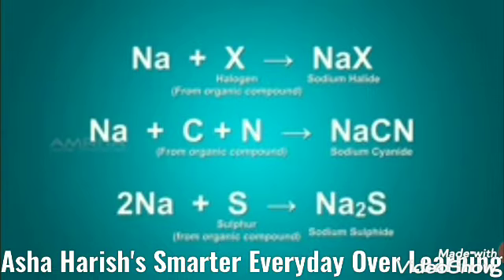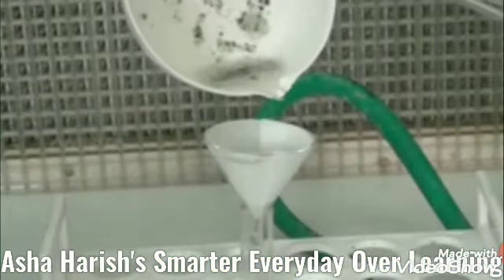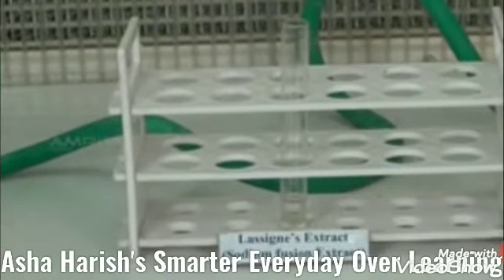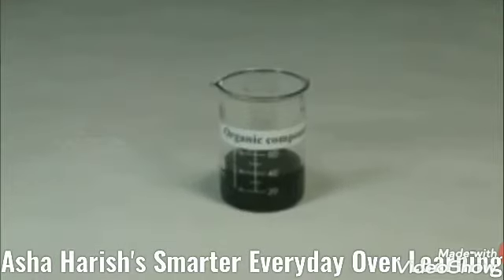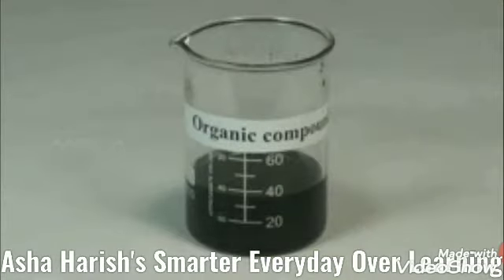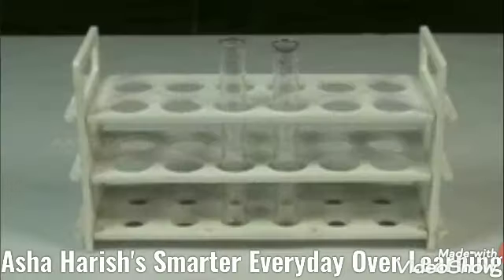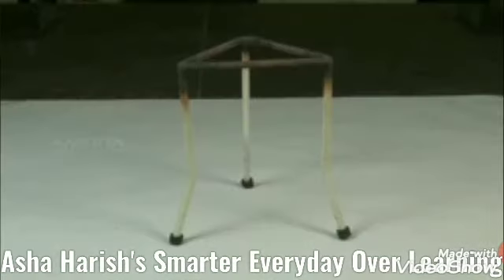Okay, these are the chemical equations you are seeing on the screen. And now it's a boiling process of a small piece of sodium metal. Here, what you have to take, what are the apparatus, and this is the organic compound containing halogens present in that. And what are the materials required to do this activity? Metallic sodium, distilled water, organic compound, forceps, test tube stand, tongs, funnel, filter paper, wire gauze, tripod stand, Bunsen burner.